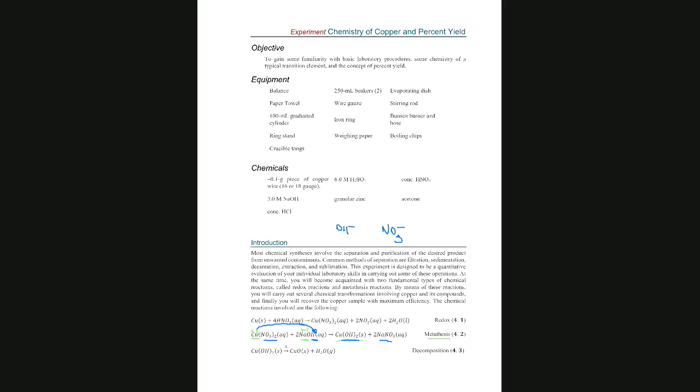So what you start to do in the third reaction, we heat the blue precipitate of copper hydroxide. And what do we see? This little triangle means that it's heat. We are applying heat. And we observe that the blue precipitate of copper hydroxide turns black. Why black? Because that is the color of the copper oxide.